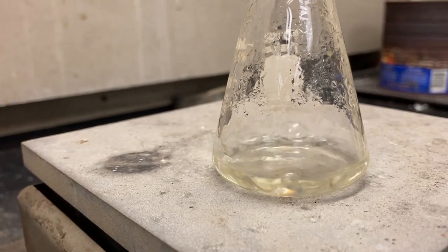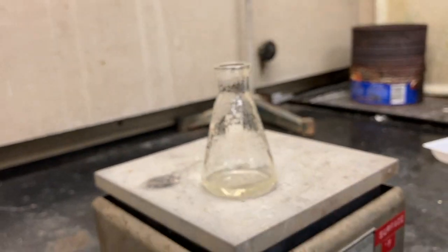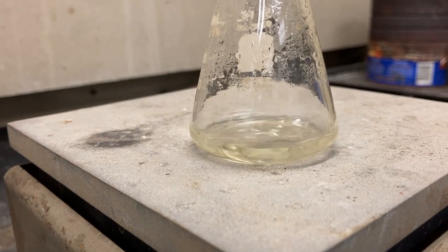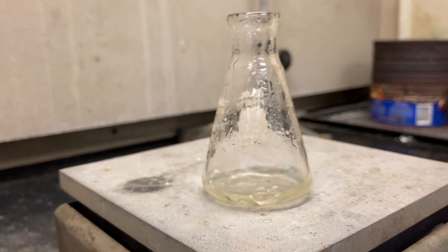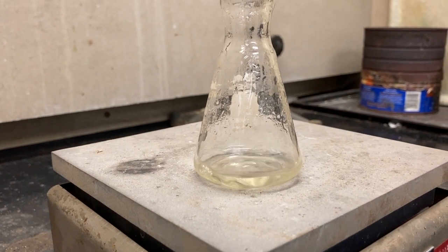Mr. Parker, I noticed there's a little bit of discoloration. It used to be a little clearer, but now it's... Yeah, that yellow color is from the chlorine. Oh. I wonder if the solid will be yellow. If chloride makes the solution yellow, maybe the solid will be yellow too. Yeah, there'll be some traces of yellow in it. Huh. So we're just going to keep letting that boil.